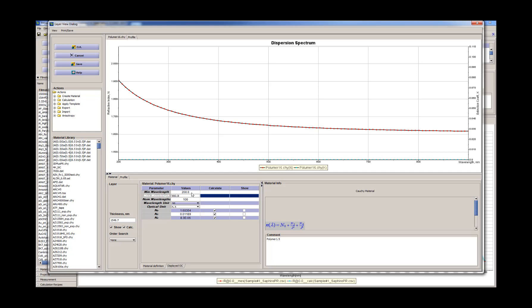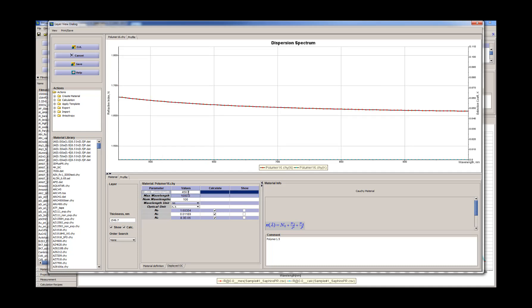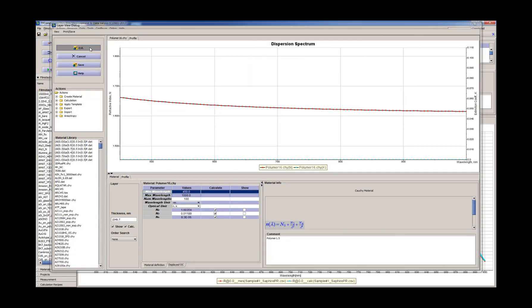What we forgot to do is to adjust the range of this model. So this is the optical constants, about 1.65. It sounds reasonable for a refractive index of the photoresist.